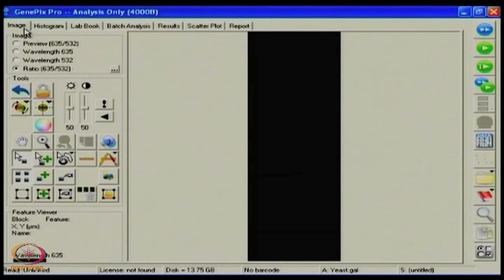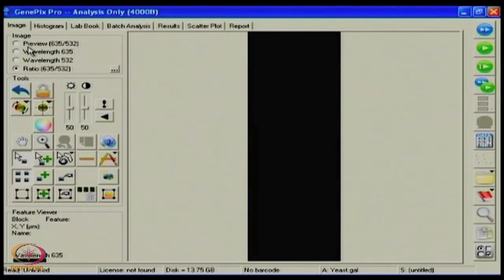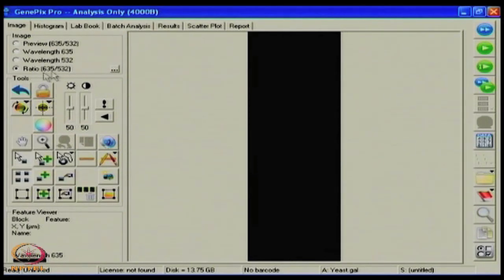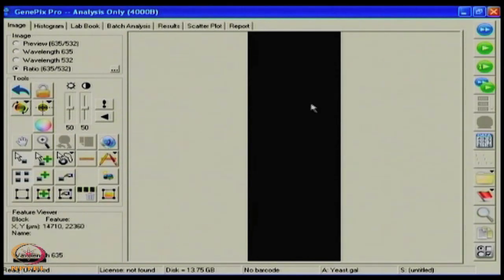Let us look at the major function of imaging - what and how one controls for the best image acquisition. Imaging can be done at different wavelengths: a preview can be done at 635 and 532. In a single laser base, the wavelength can be done at 635 or at 532. The ratio of imaging - how both channels have performed together - can be looked at using a ratio imaging button. This allows you to see how the image is being done after the scan; you can look at one channel, a preview channel, or different channels.